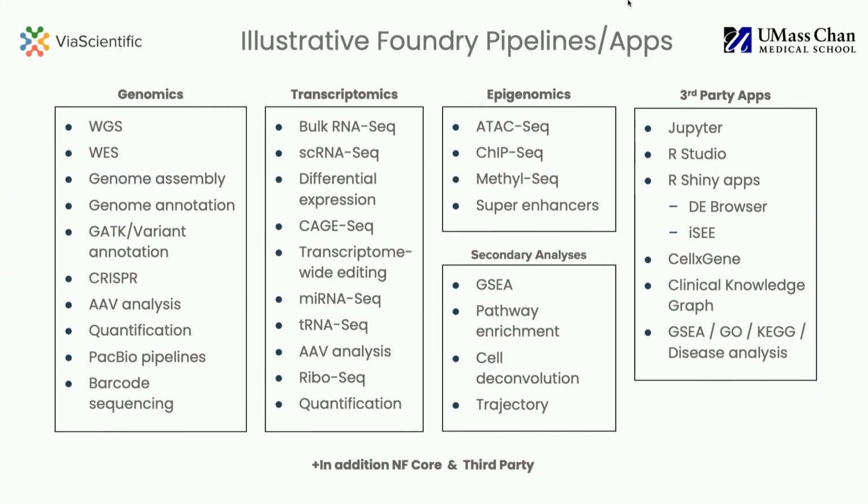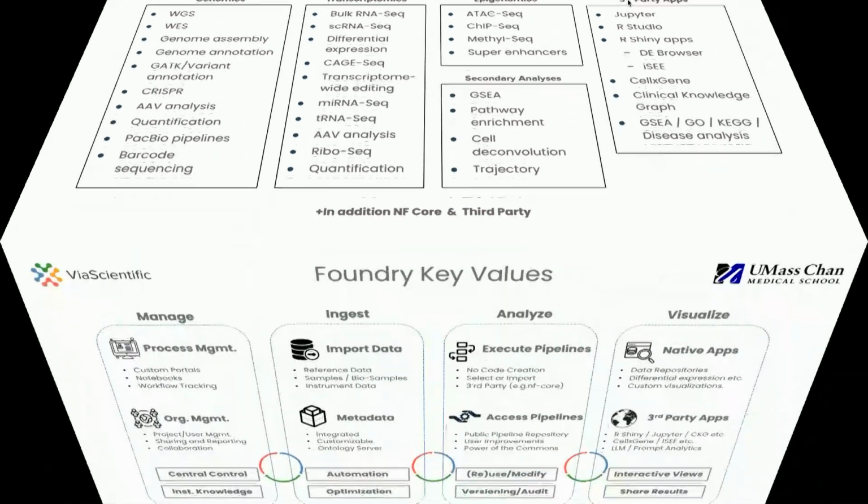We have pipelines in these areas, and we are continuously working on adding metabolomics and proteomics fields too. We have one integration of proteomics and transcriptomics data with metabolomics. We are just now creating some scatter plots to show the correlations and those kinds of things. But again, this is up to people how they create their own visualization after data processing.